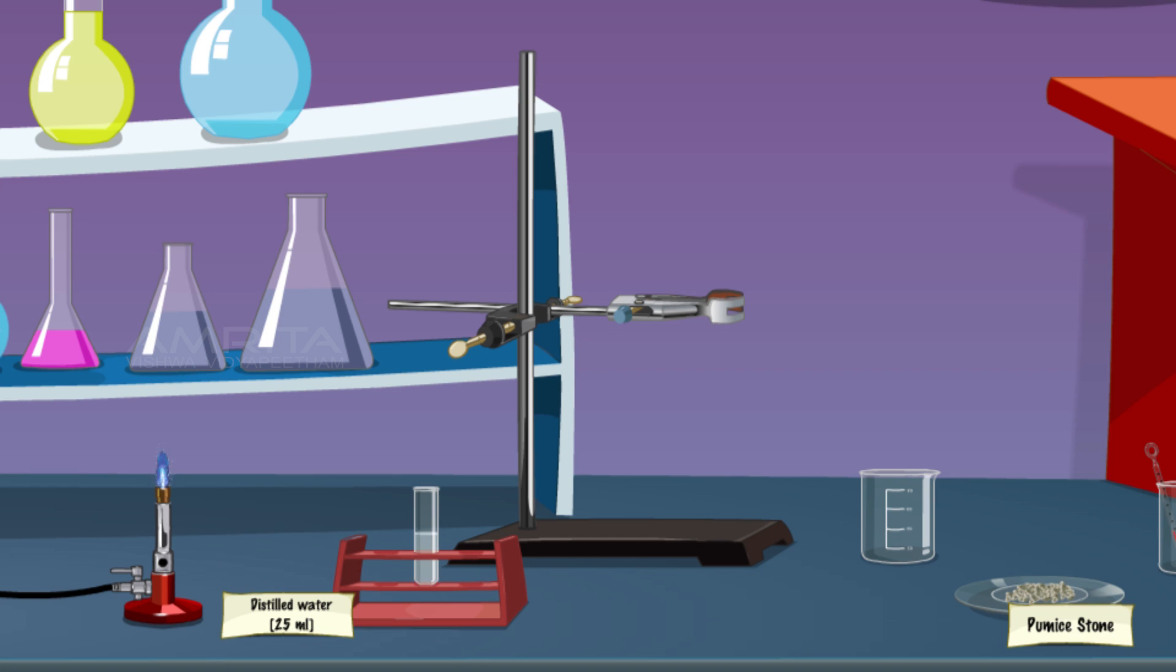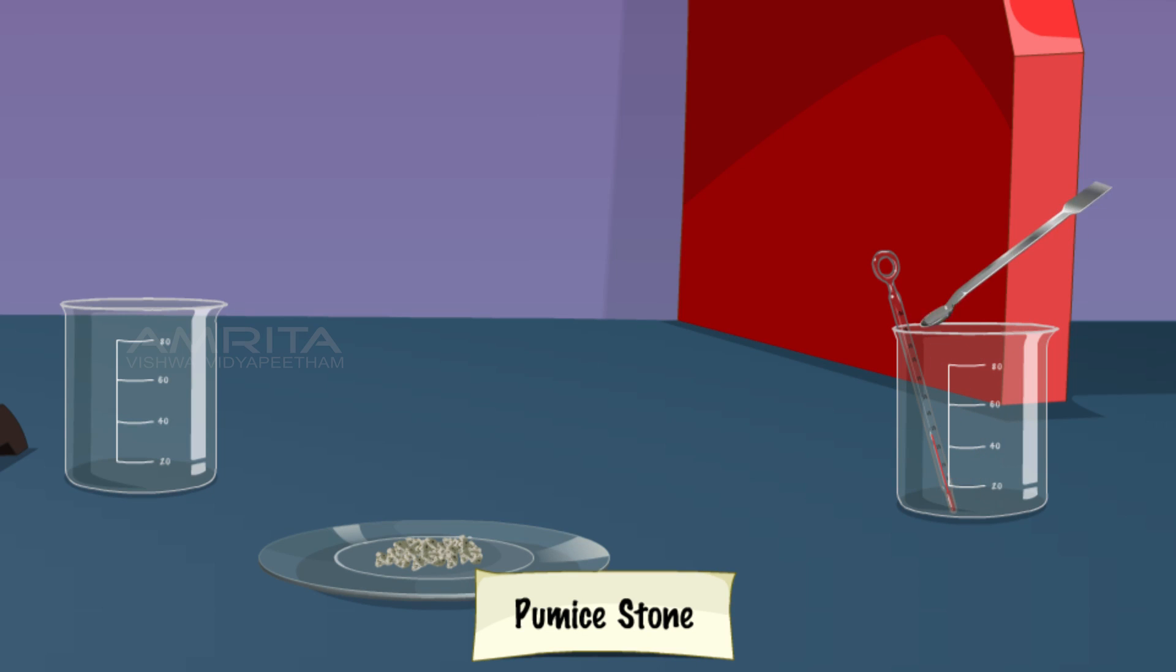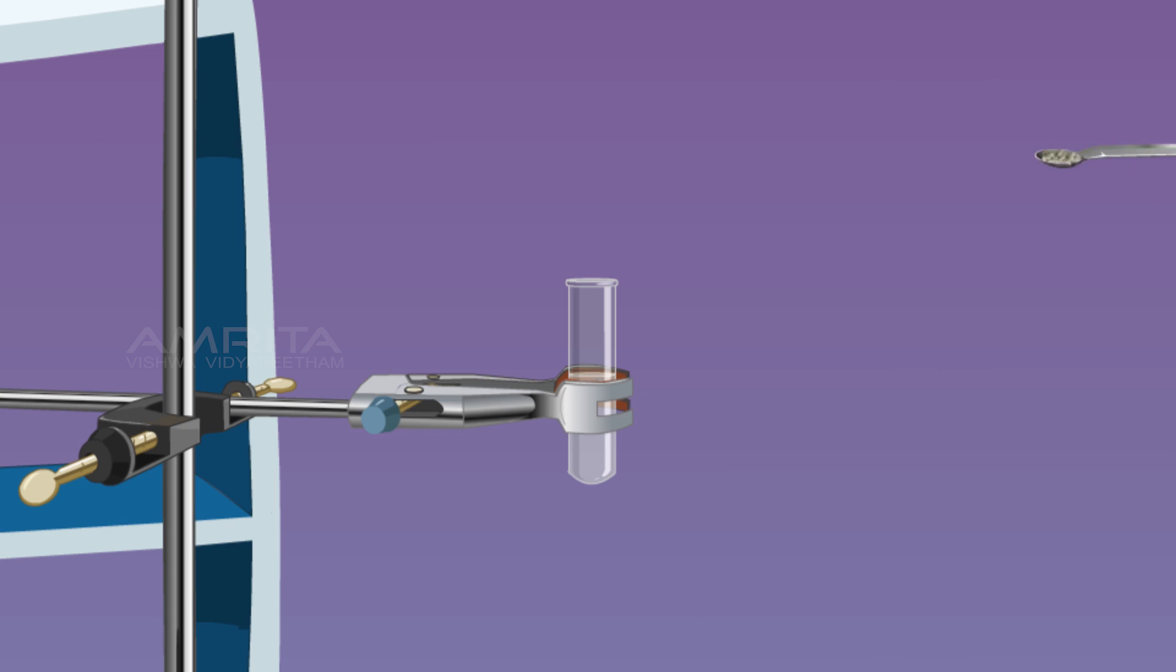Take about 25 ml of distilled water in a boiling tube and clamp it to the stand. Take a few pumice stones using a spatula. Put them into the boiling tube containing distilled water to avoid bumping while boiling.